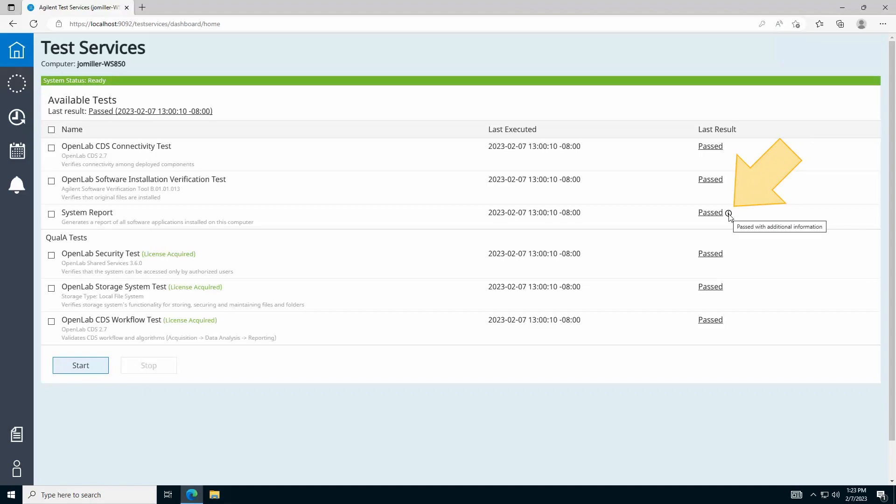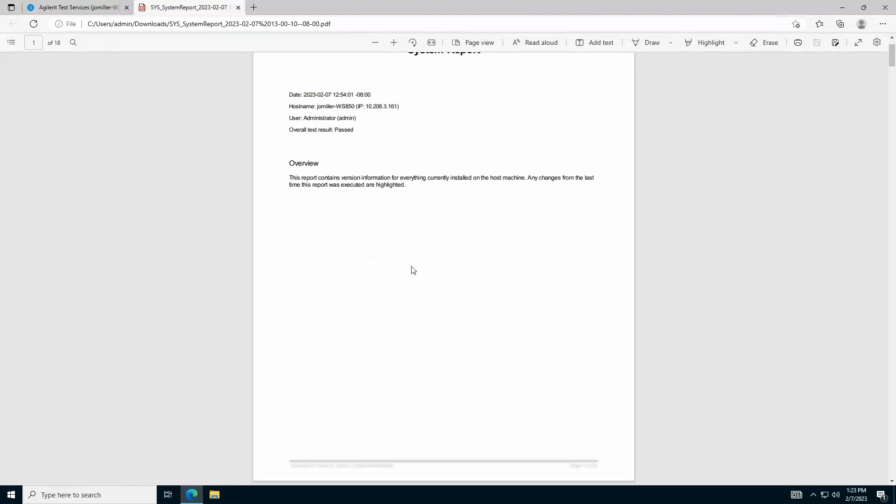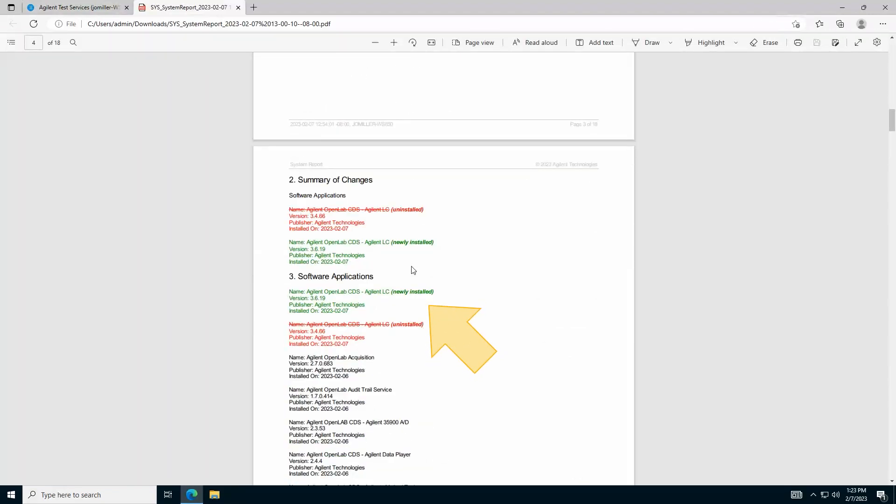Information icons like this indicate that additional information is available in the report. In this example, you see that the report highlights a newly installed driver for Agilent LC instrument control.